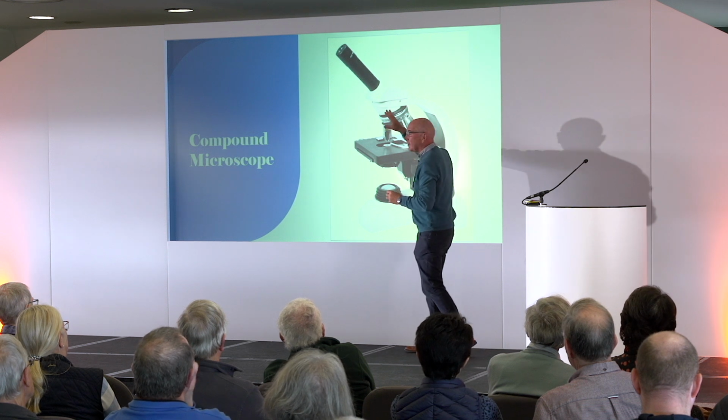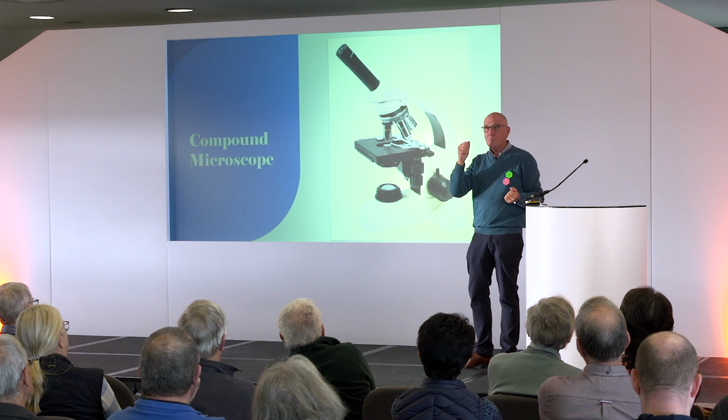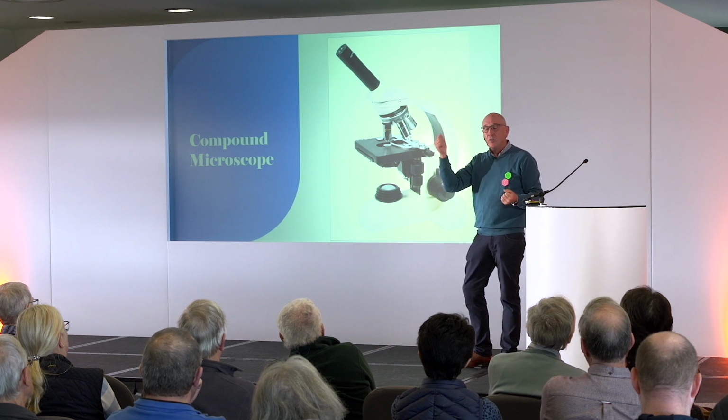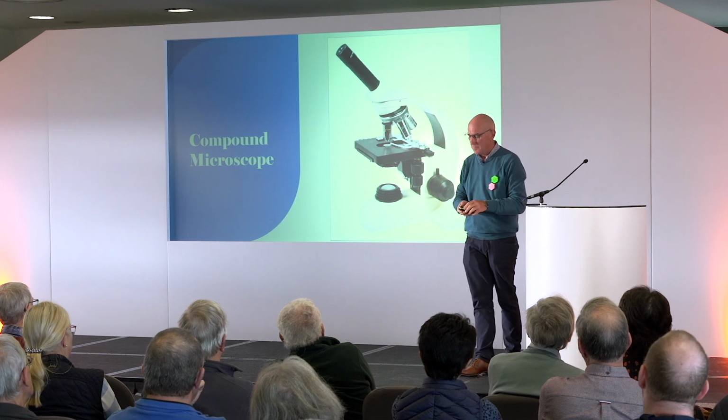So you have to set that up. And every time you pick your microscope up, even if you haven't used it for a long time, even if you used it yesterday, you've got to reset it and make sure it's set optimum. That's where you get the best image.